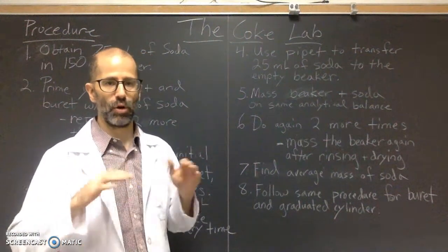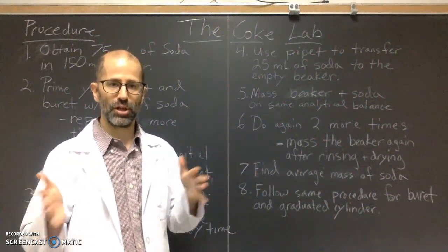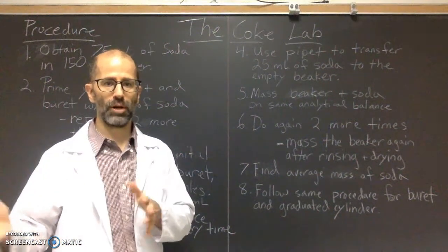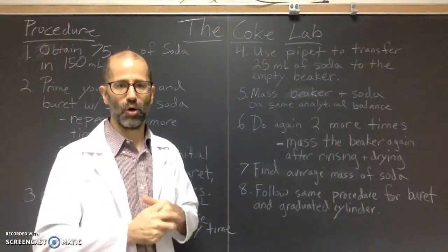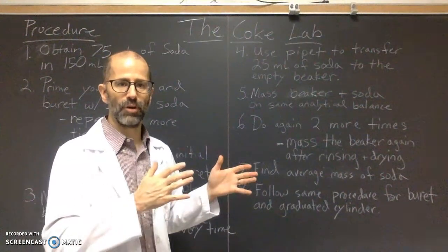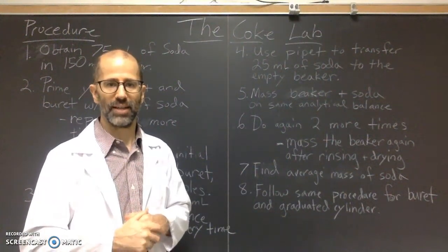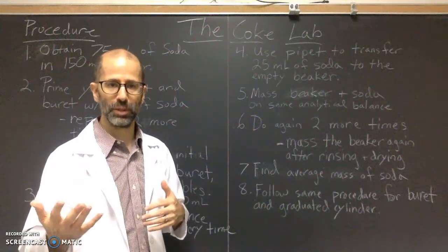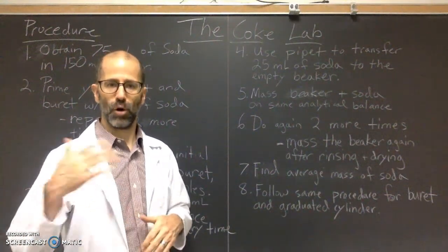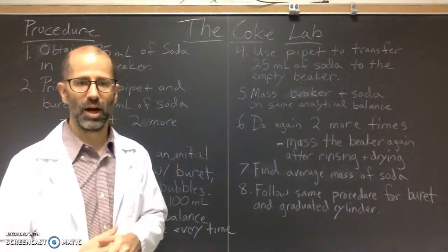So you might notice as you're doing the experiment that the measurement of the balance will go from 4 decimal places to 3 decimal places, and that's because you've gone over. So from 0 to 59.9999 grams, it'll give you 4 decimal places, and then if you go above that, then it'll drop down to 3 decimal places. So be aware of that.